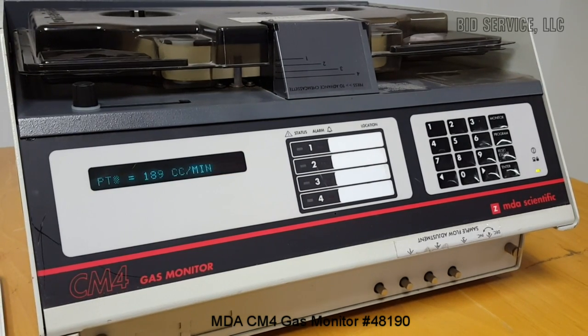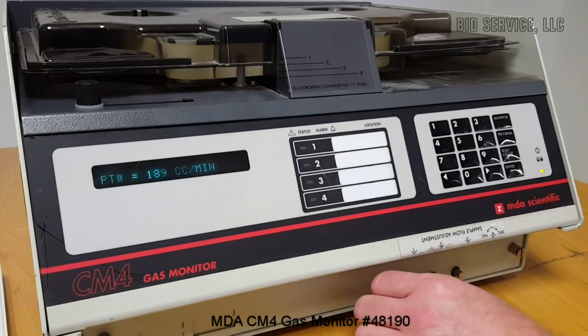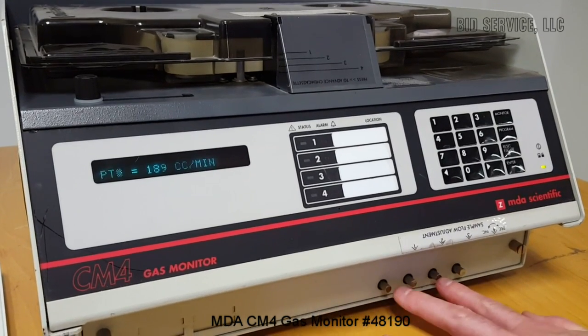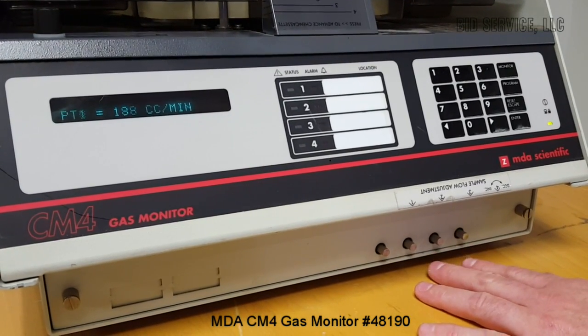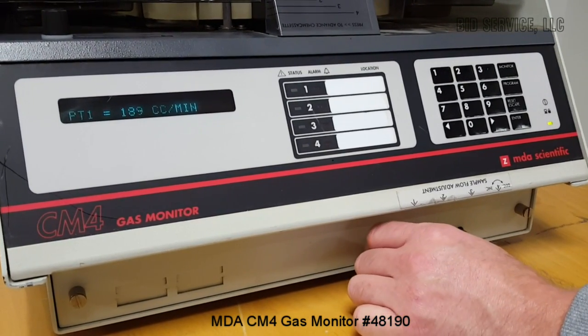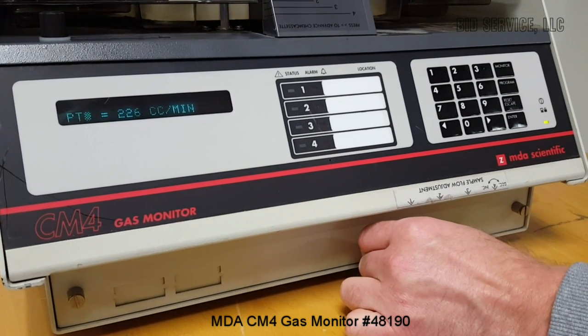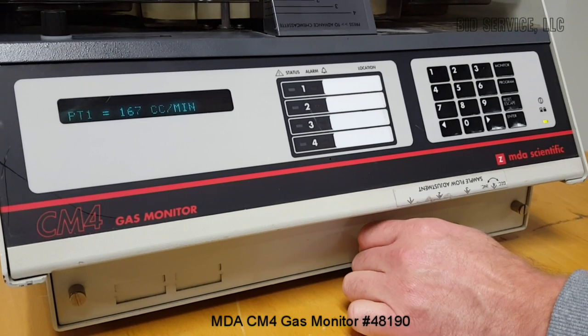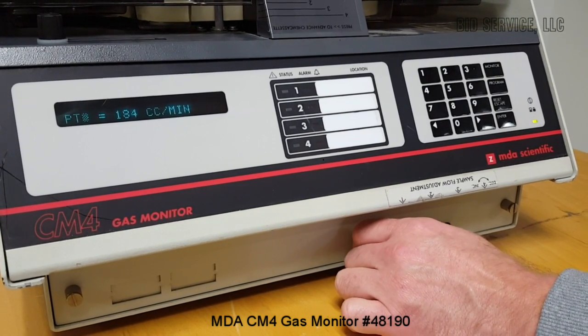Now the pump's running and it wants you to set it for 180 cc's a minute. Down here you have your four regulators to control the flow on each sample. We're on sample one — increase it or decrease it based on how much you want it to flow and your program parameters.